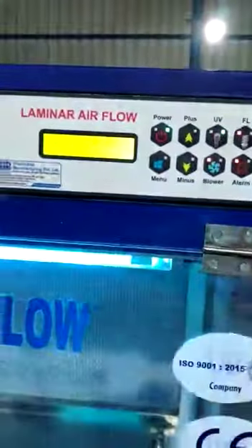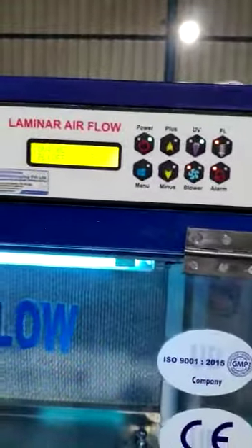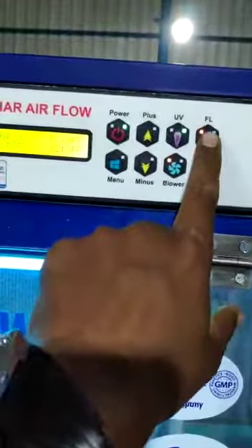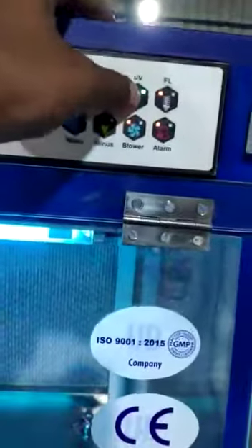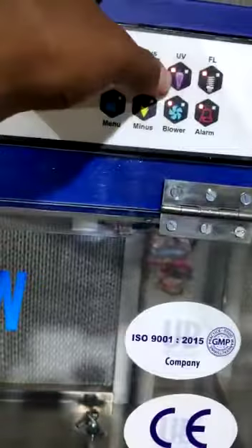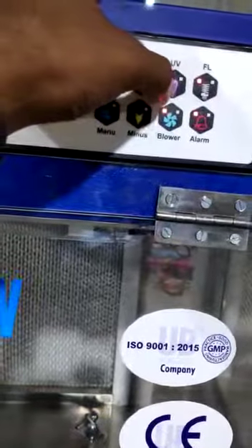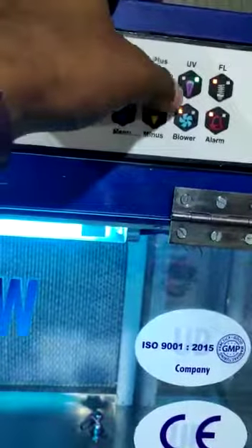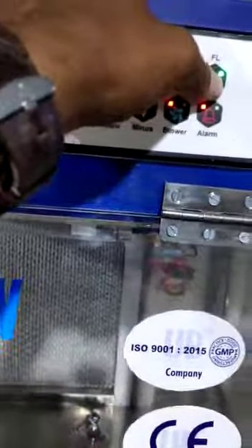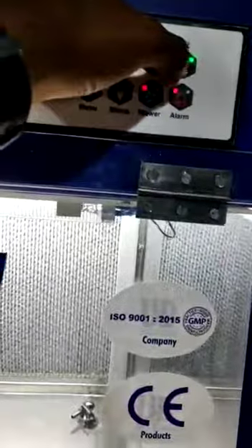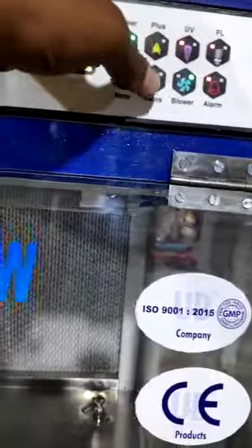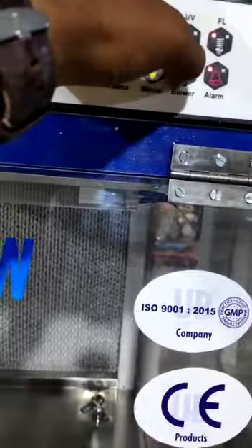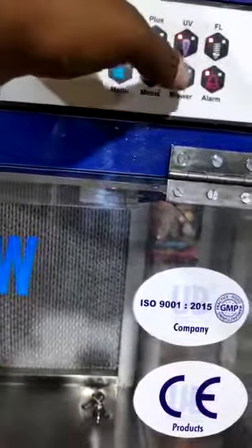If you press UV, UV is on. If you press fluorescence, it will be on — it is very bright. When UV is on, green light is there; when UV is off, red light is there. When fluorescence is on, green light is there; when fluorescence is off, red light is there. When blower is on, green light; then again red light when off.